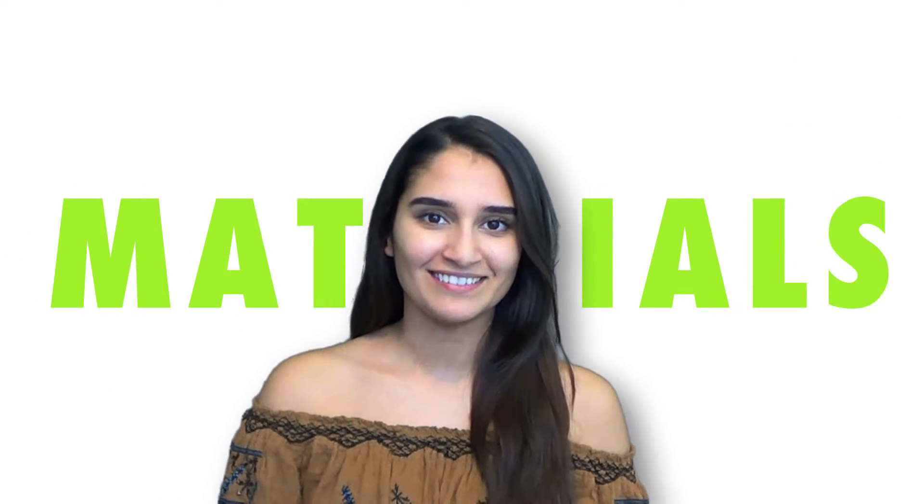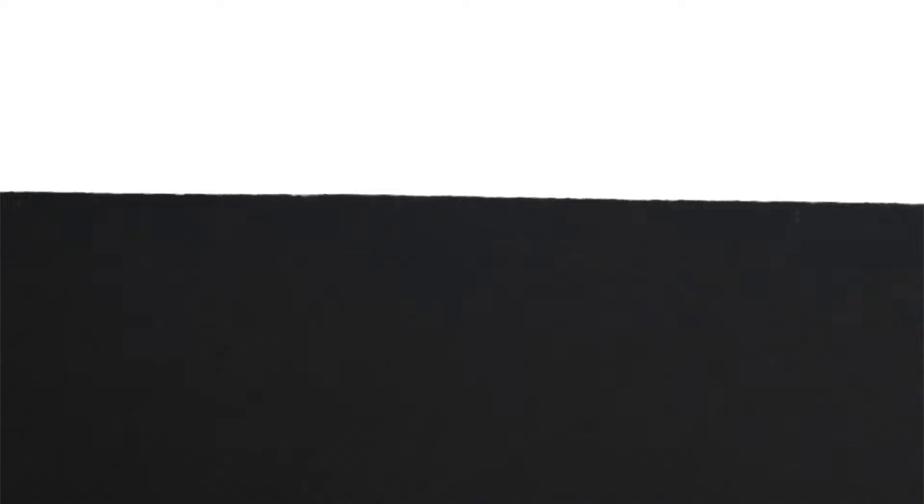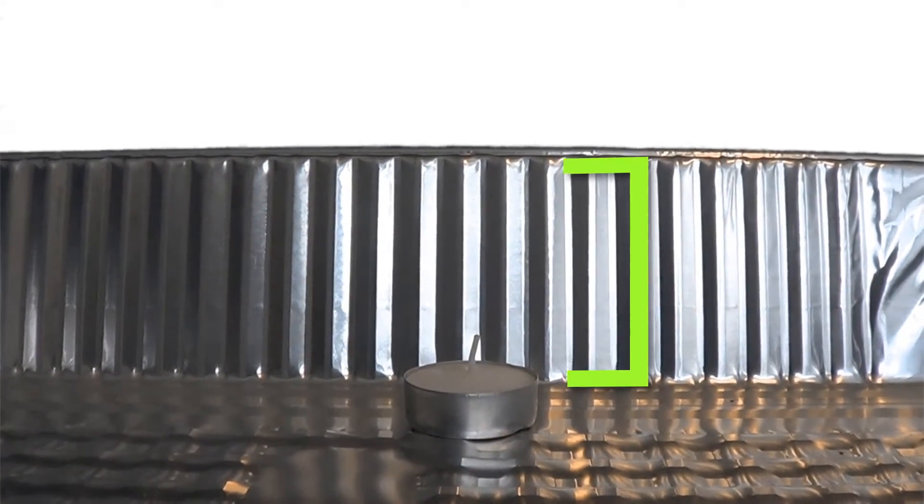With all the preliminary stuff done, let's go over all the materials you'll need. Firstly, you'll want an aluminum pan of any size. You'll also need some unscented tea light candles that aren't taller than the height of the pan itself, along with matches to light the candles. For covering the pan, you'll also need aluminum foil and plastic wrap. Finally, you'll just need duct tape, scissors, some water, and a few plastic pipettes.